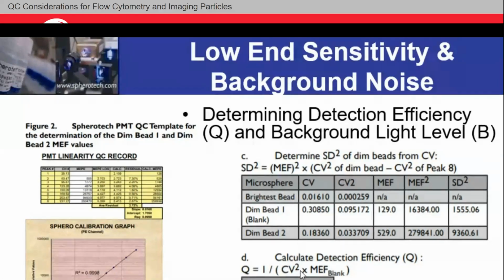On the other hand, if you're getting a very, very small value, like 10 to the negative 4th, again, that might be too poor. You're not going to be able to resolve that. You're not going to be able to say anything statistically significant about that population. So we can go back and forth about what is a good one or a bad one. But as I said, longitudinal data is your strength here. It's always going to be something that you rely on.